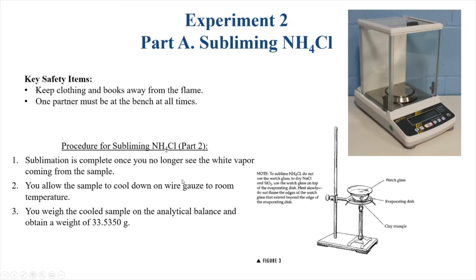Okay, so once we've done the sublimation, we'll know that the sublimation is complete once we no longer see the white vapor coming from the sample. We're going to take it off and put it onto some wire gauze to cool. The reason we put it on wire gauze is to prevent the evaporating dish from cracking.